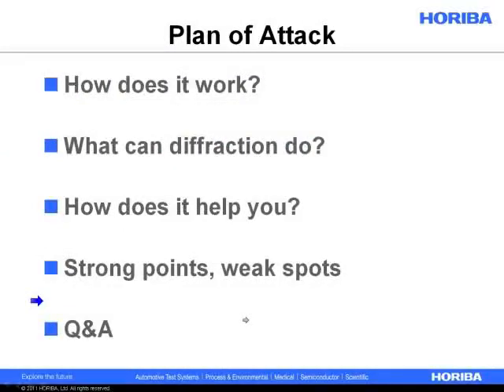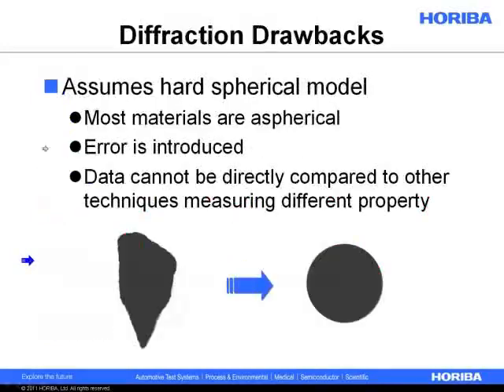All right, so we covered the first 3 topics. Now I want to talk very briefly about what the strong points and the weak spots are for diffraction. In fact, I'm going to focus mostly on what the drawbacks are for diffraction, because sometimes we don't talk about it enough.